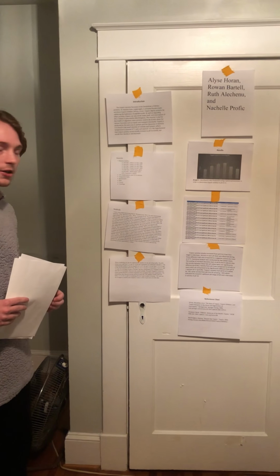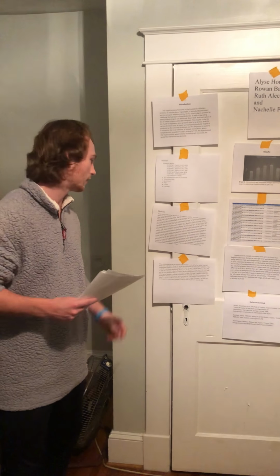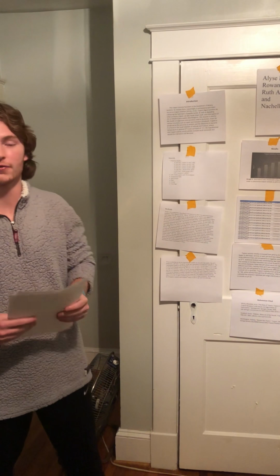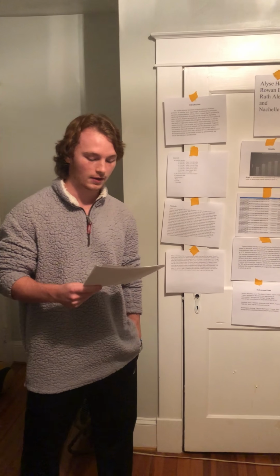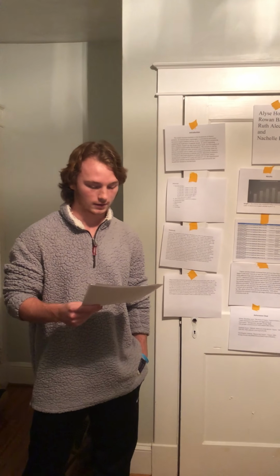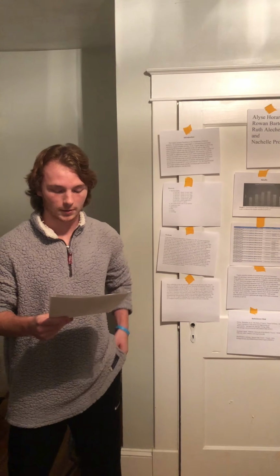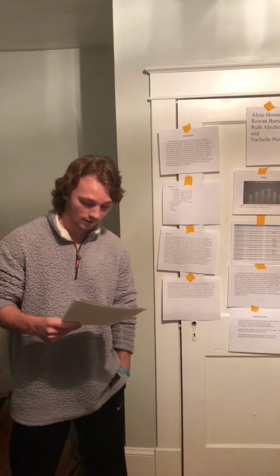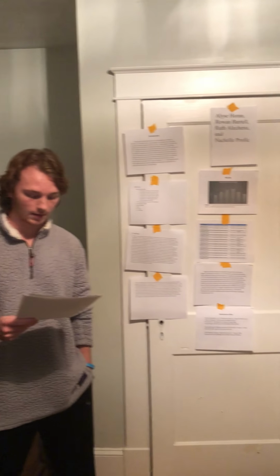The test tubes were then incubated for 20 minutes at 37 degrees Celsius. And after that, we added 500 microliters of 10% TCA. The purpose of TCA is to stop the enzyme and precipitate azocasein that has not been digested. The test tubes were then put into a centrifuge at maximum speed for 2 minutes. The purpose of centrifuging after the TCA is to remove the macromolecules of undigested azocasein and the enzyme.